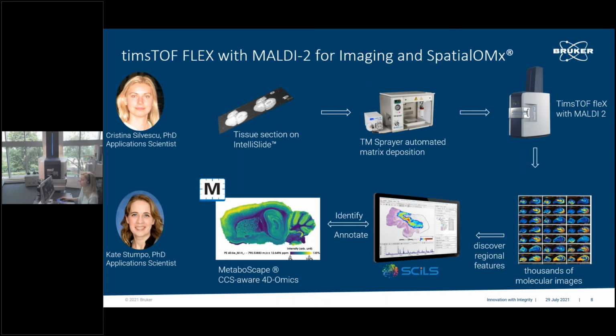We mount the sections on the glass slides, and after that we take an optical image of this glass slide with the samples.